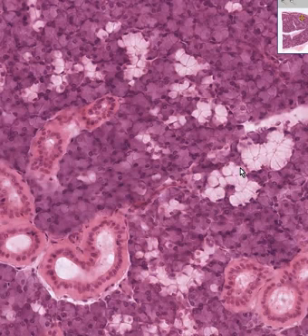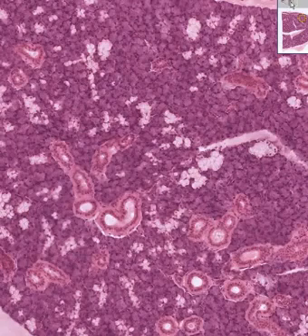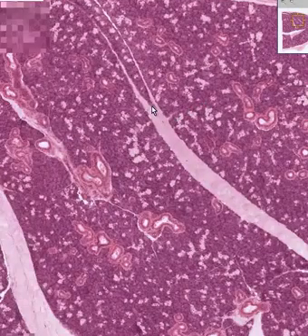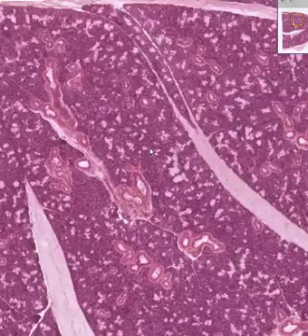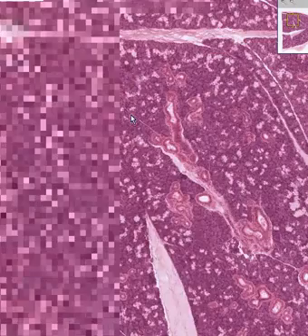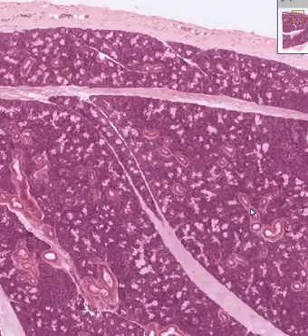I don't think I really have to say anything more, but I would like to really find a nice intercalated duct, if I could, because most of these intralobular ducts here are striated ducts. And could this possibly be one? No. I don't think we're going to see any. Maybe we'll see some on our next salivary gland, because I don't want to waste too much of your time.